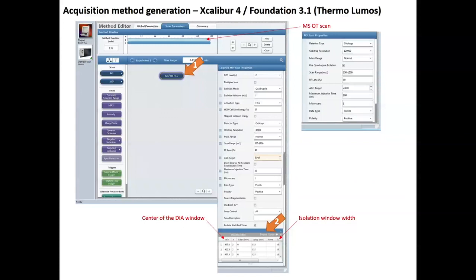So this is really the official recommendation from Thermo. You do your MS1 segment here, Orbitrap scans. Here you can push the resolution to the level you want. We usually use 120,000. And for the targeted MS2, you get this set of parameters. And at the very end of this list, you get a similar table as you had before.